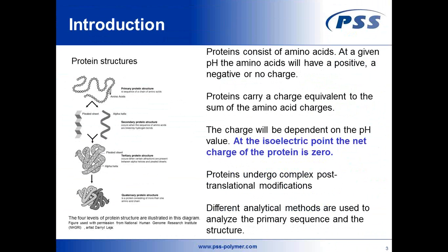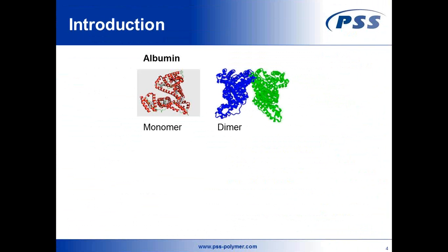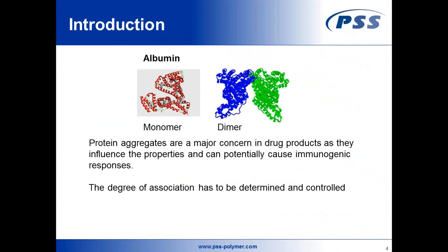So when you do protein analysis using SEC as a method, this is what you can basically discover by using the method. Proteins are, as mentioned before, globular in structure, and they can show up as monomers, as you can see on the left-hand side, or dimers or trimers, or higher aggregates of the proteins. Those are the so-called impurities of the proteins, because the activity of the protein given for any biomedical applications is mainly given by the monomer.